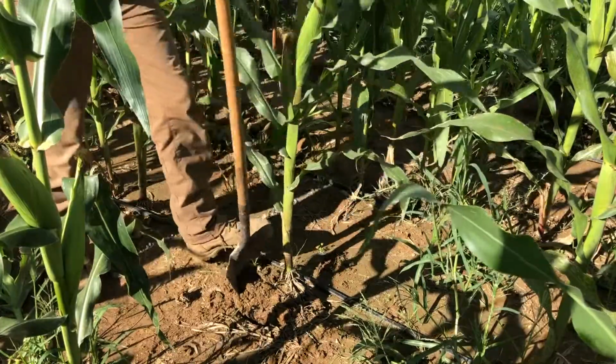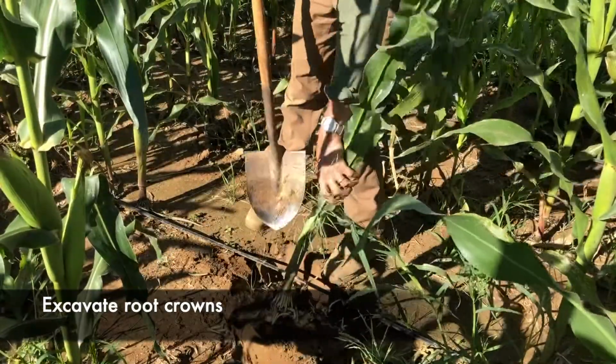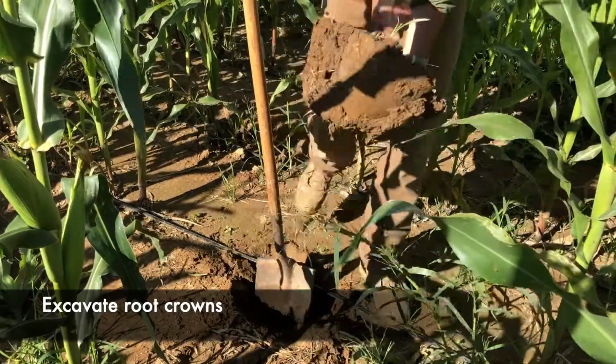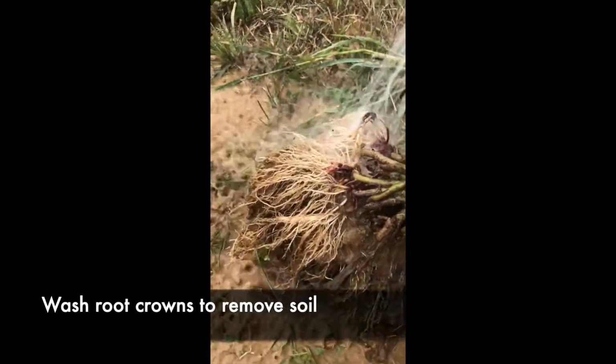Since roots are directly responsible for soil resource capture, our group is particularly interested in genetic variation for root anatomy that may affect how efficiently different crop varieties acquire and utilize resources like water, nitrogen, and phosphorus. To collect samples for anatomical analysis, roots must first be excavated and washed in the field.